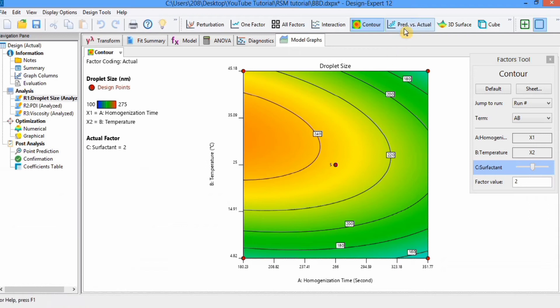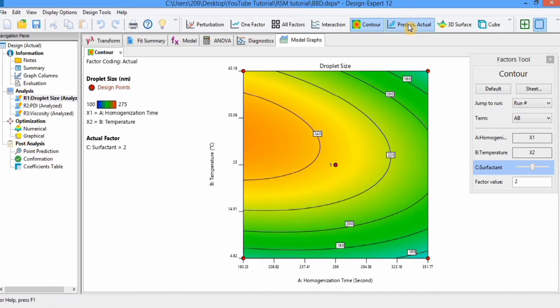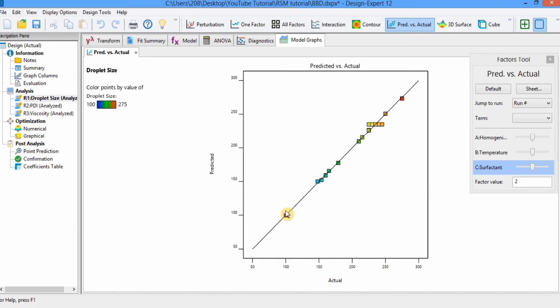Next is the predicted versus actual graph, which should be linear. If it is not linear, it indicates a fault in your model. The graph shows actual values versus predicted values. For example, if you click on any dot, you can see the actual value is 100 and the predicted value is 99.62.